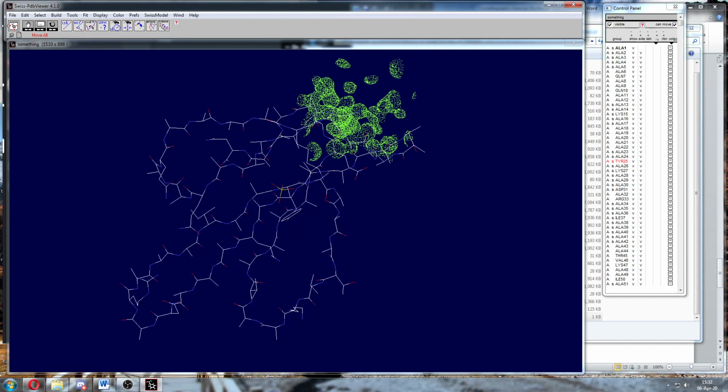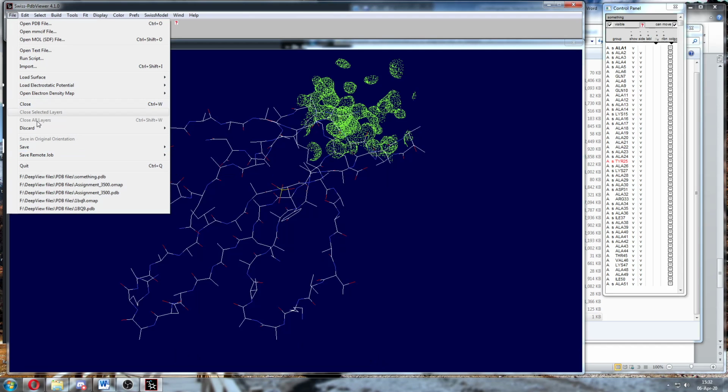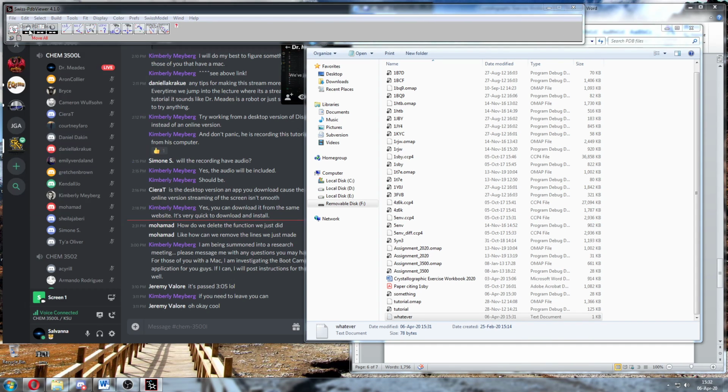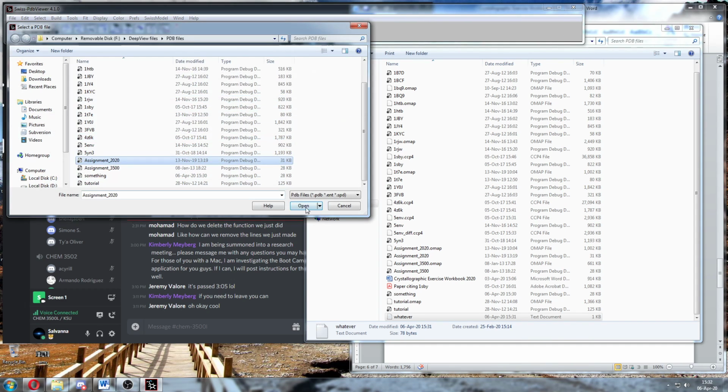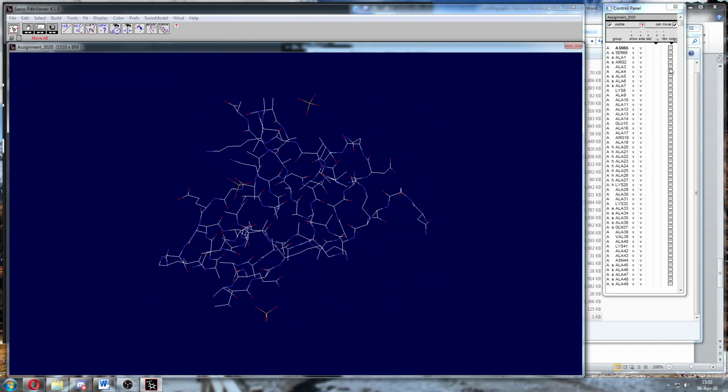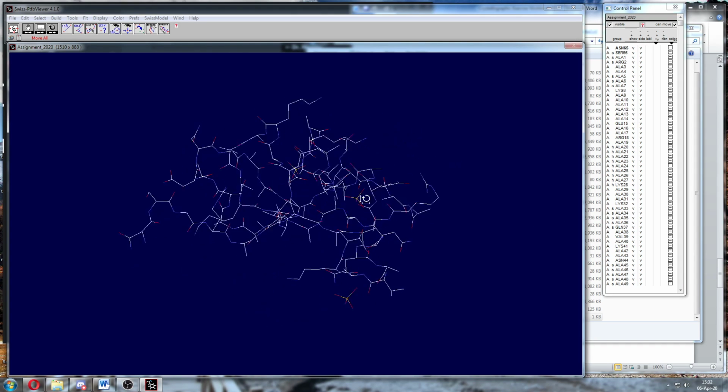Okay, so the one I want you to do, and I'll stop and answer questions after this. So I'm going to close this one. The one I want you to do is assignment 2020. There it is. It's not very long. It has 64 amino acids in it. So I want you to assign all 64. Some of them are done for you, so you don't have to do 64 of them, but many of them are still listed as alanine.